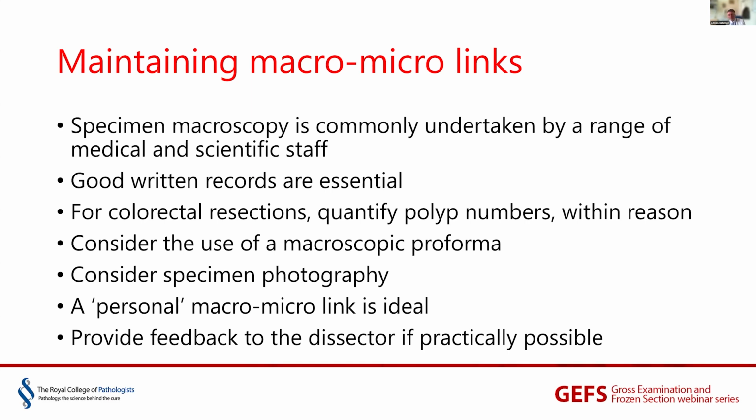Obviously, specimen photography is an alternative to that if it's not possible for you to be there at or before the time of cut-up. And again, if someone, particularly if they're training, and if they're not involved with the reporting of a specimen, please do provide feedback to that person in a constructive way, if there's something that you think that they can do to improve their dissection or block taking strategy in the future.